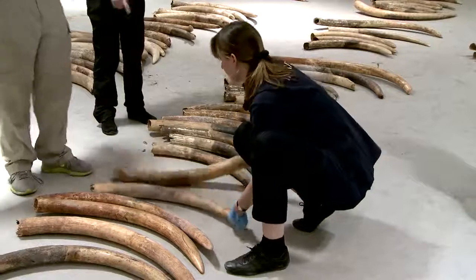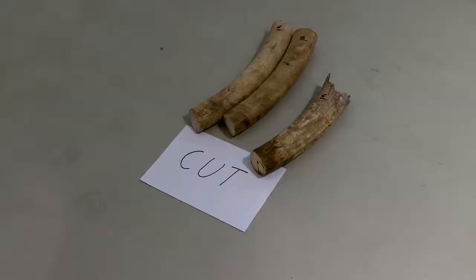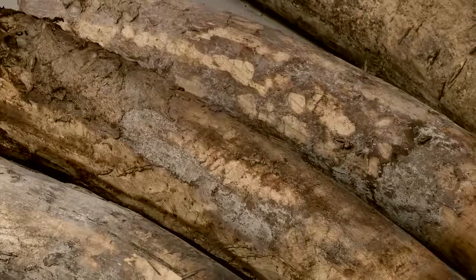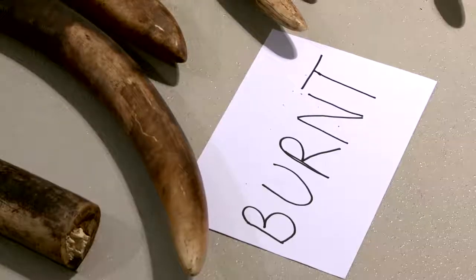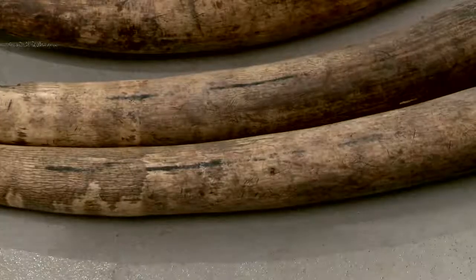Divide the remaining tusks into groups based on shared external characteristics. Examples of groups include whole tusks versus tusks cut in sections, tusks with a lot of tissue remaining on them, tusks with burn marks starting at the gum line, tusks that are similarly coloured, for example orange or white, and tusks with similar man-made markings, such as writing or numbers in the same colour ink.